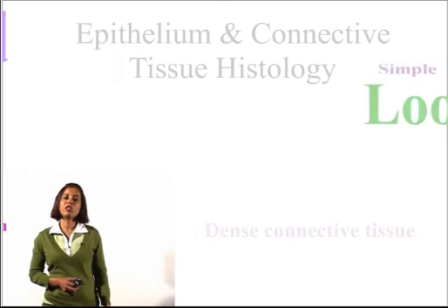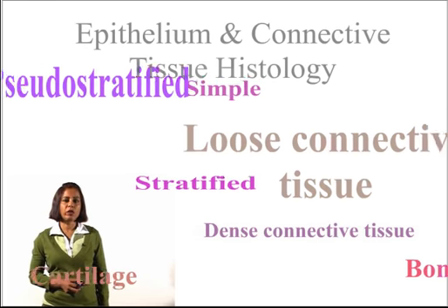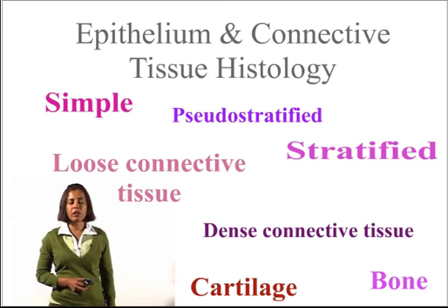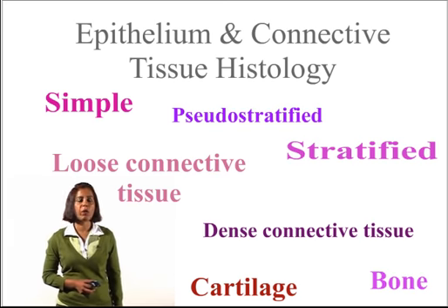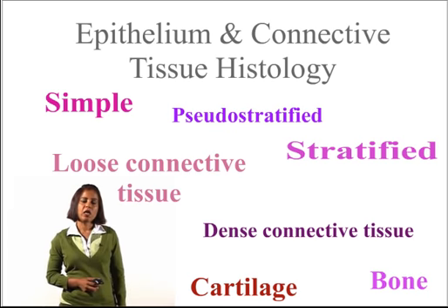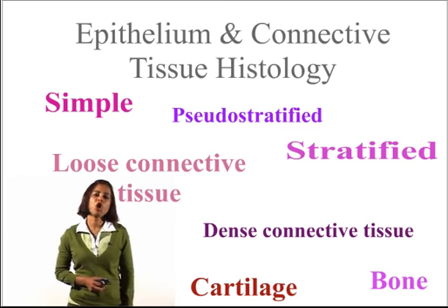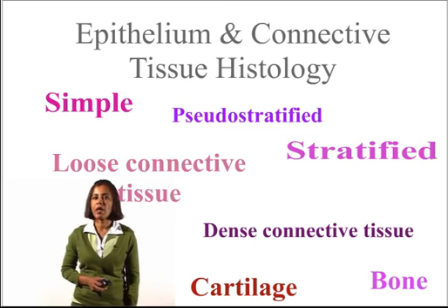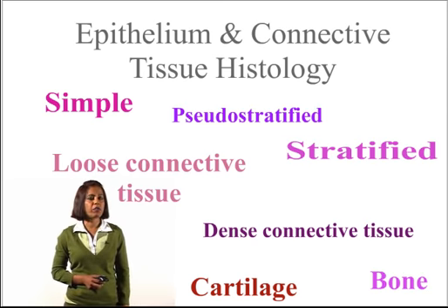Everyone, what you're going to view now is a tutorial on histology. Histology is rather a difficult subject and most students falter when looking at the slides. So what I'm going to do is walk you through some of the slides that have been linked to the lab. I'm not going to go through all of them, but I'm going to go through some of them so you know what you're expected to look at.